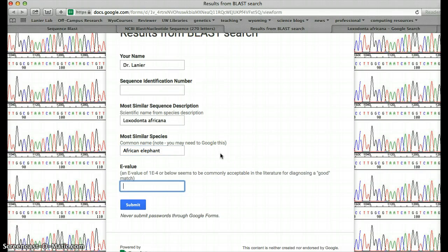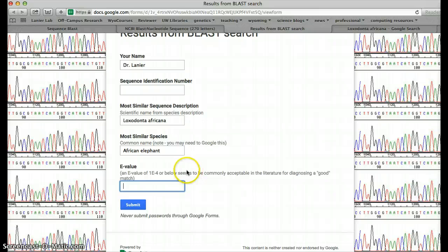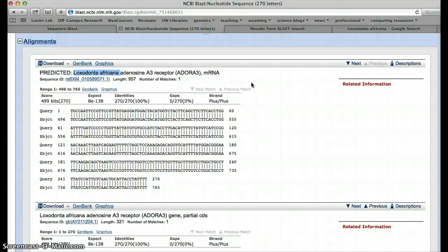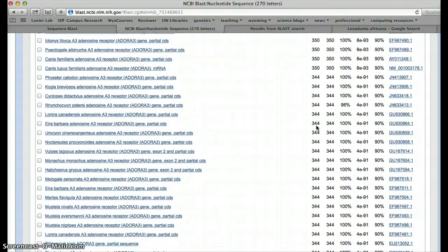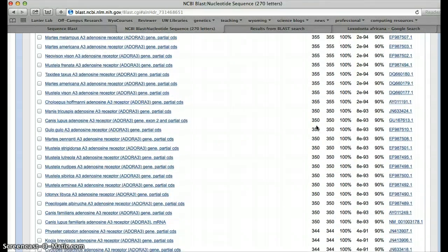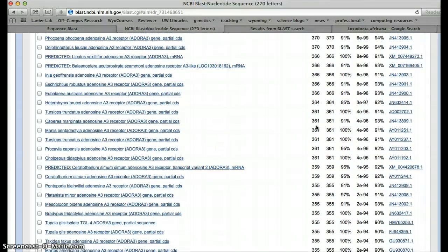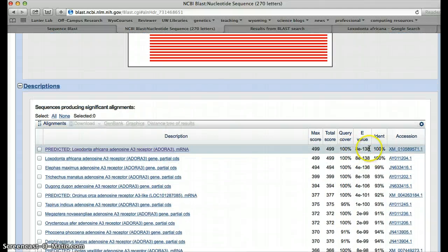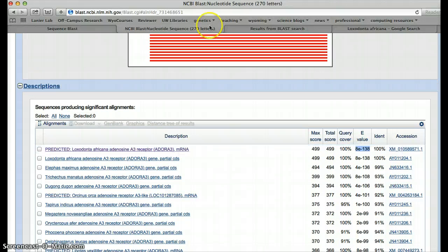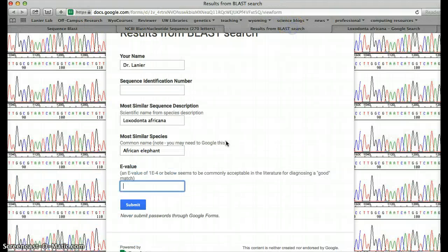And the e-value. Now this e-value is a diagnostic for determining whether or not something's a good match. If something is smaller than 1 e to the minus 4, that means it's a really good match. In this case, our e-value, we have to go back up to the top for it. Our e-value is 8e to the minus 138. So this is a really strong match.